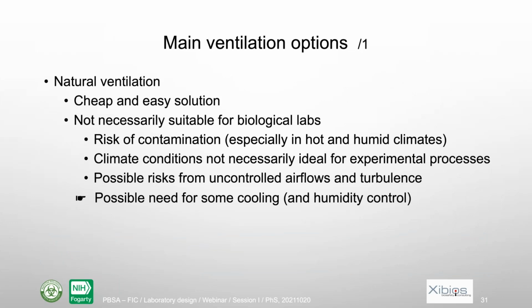What are the options for ventilation? The most immediate one, I would say, is natural ventilation. It is cheap and it's easy. However, it's not necessarily suitable for biological labs, for a number of reasons. The risk of contamination, and especially in a country like Pakistan because of the climate. Also because of the climate conditions themselves, which are not good to work a long day on experiments and so on. And also because of the risk of non-controlled airflows and turbulence.